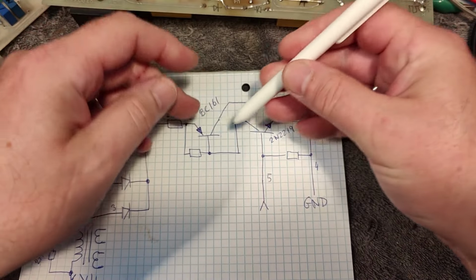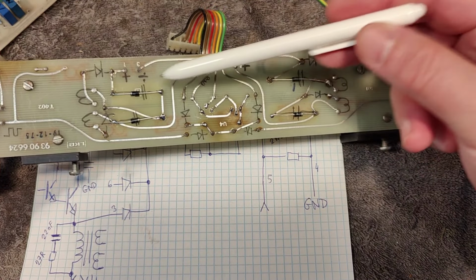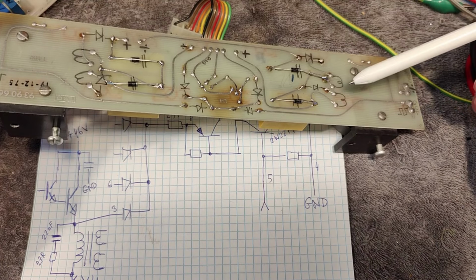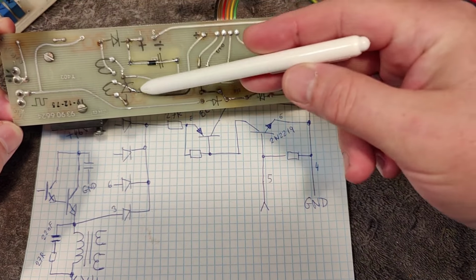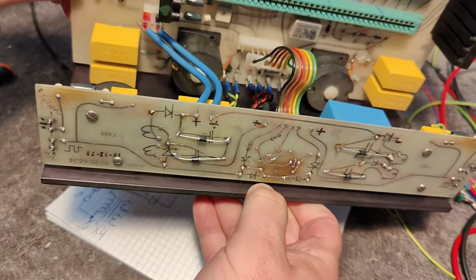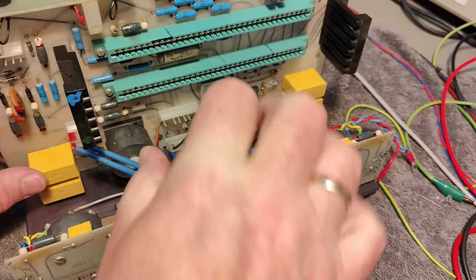But anyway, both of my transistors work, and I put them back in, resoldered everything, cleaned it up real nice and fine, and that will be my diodes that I put over all capacitors. So if and when one of the power drivers or one of the transformers or one of the solderings, one of the rectifier diodes, whatever goes wrong, we're not going to have any bad side effects. So we have the diodes on each of the 4 systems. So I really hope this is going to be one of the final times that I reassemble this. I tried my very, very best to make it look as nice and beautiful as I possibly can.